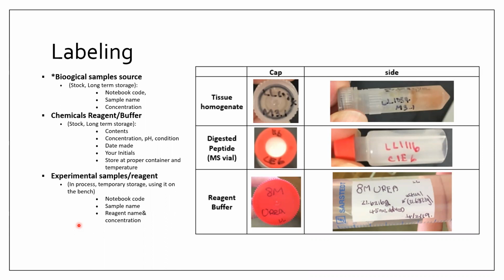Just one note, I learned it the hard way in my experiment: try to keep only one reagent, the reagent that you're actively using at that time, in your bench area, like if it is on the cleaning, like a solvent pad. The reason is that it will not confuse you.